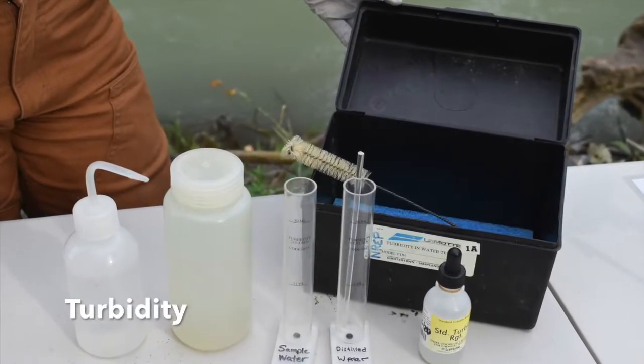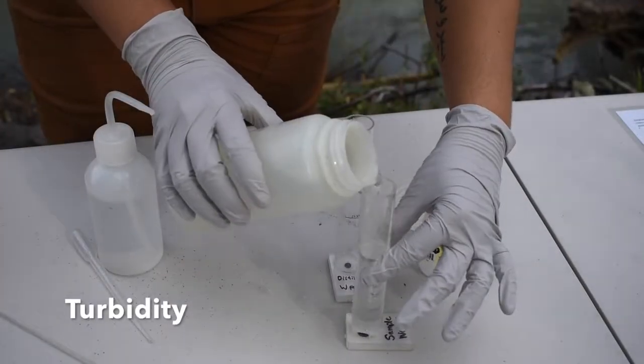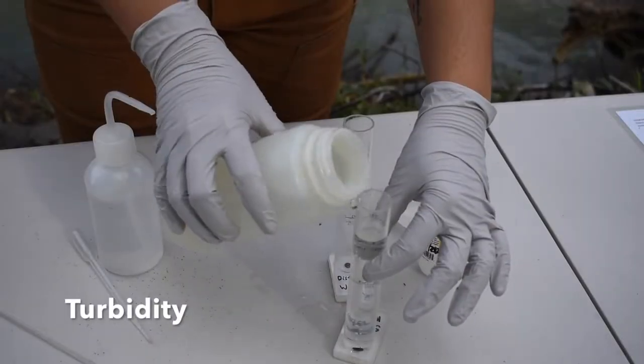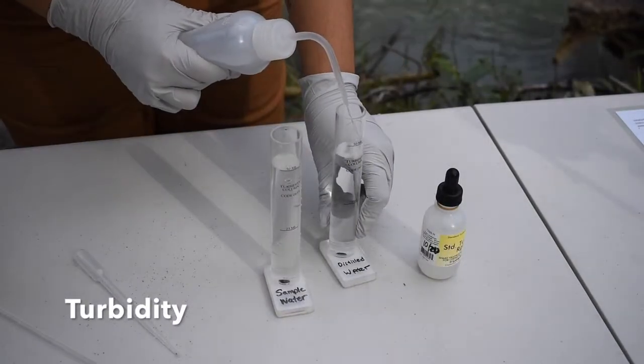Here are all of the materials you will need to test the turbidity. First, we're going to fill each tube with 50 ml of water. One with sample water and one with distilled water.